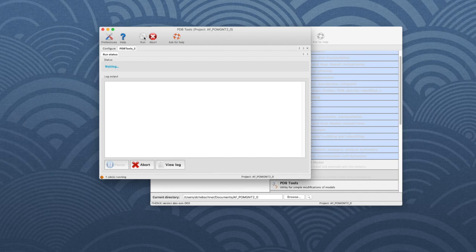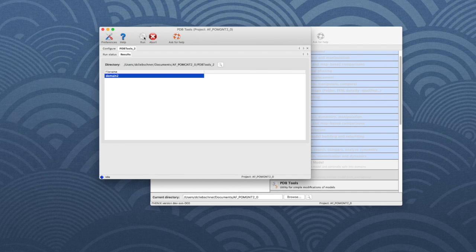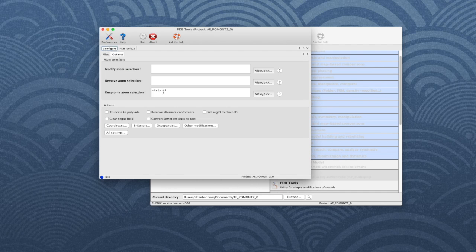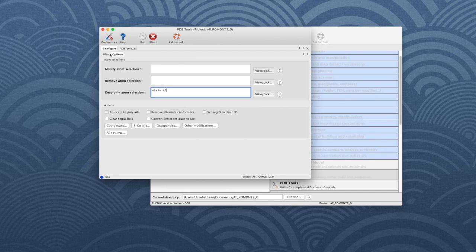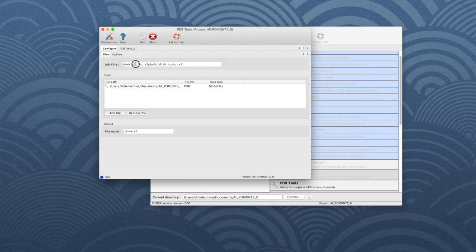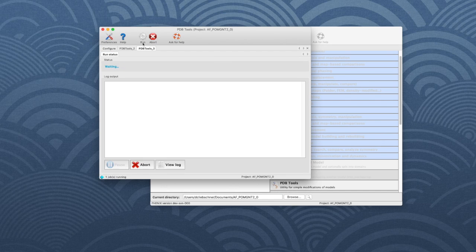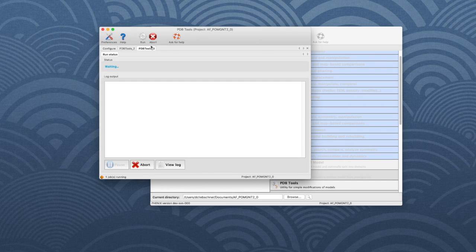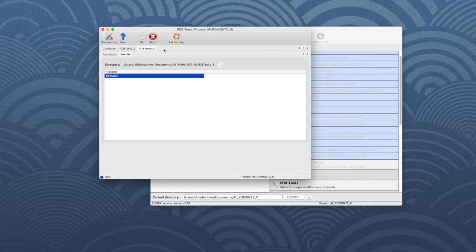When it is finished, run the program again, this time with the selection chain A3, and don't forget to change the output file name to domain_3. The output files will be in separate subfolders in your tutorial directory.